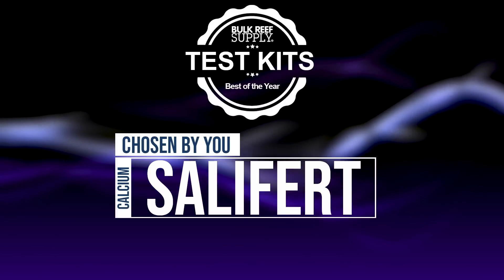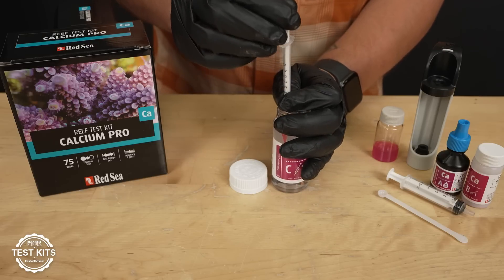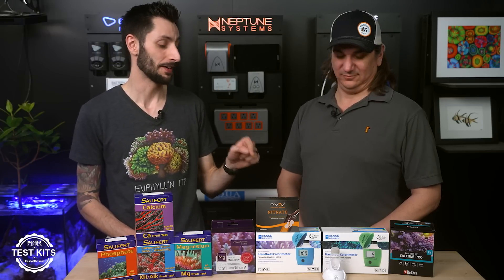Calcium test kits — drum roll — the one you guys pick up more than anything else? Big surprise: it's Salifert again. Stack all the other calcium test kits on top of each other and there are still not as many as the Salifert kits you're picking up. Definitely a fan favorite. But our best of the year pick is the Red Sea calcium test kit. We put it through big paces with all the users and combined our own experience. It's the easiest to use, easiest to perform, and most consistent results. The Red Sea test kits have really nice components — in this case, a titrator that allows you to do it one-handed — and those cuvettes are a perfect fit for the Smart Stir.